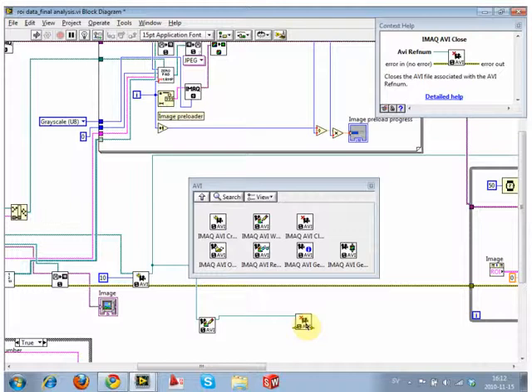You probably can rerun the program and just close it off, but if you've got a very sensitive data set and it takes like hours to analyze it, you want to make sure that you can actually read the output file, because you can't open this VI if it's not closed.